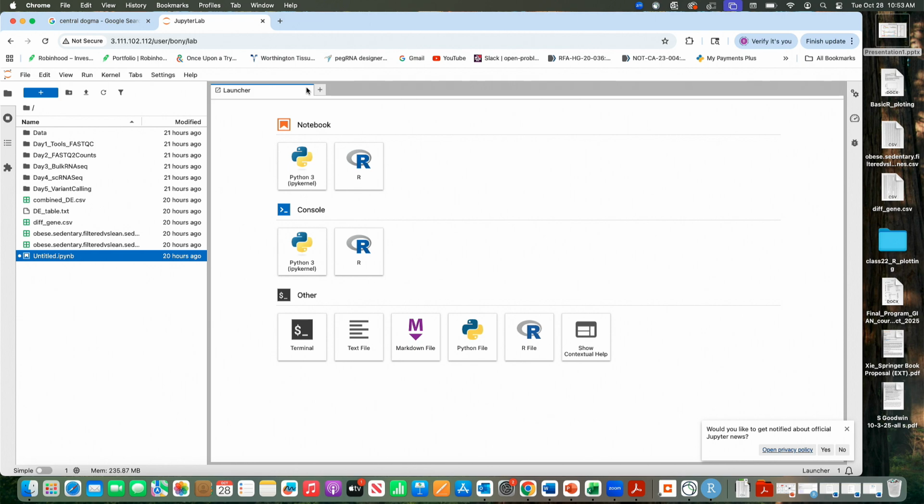It's not like you're just putting some random dots or lines together and saying this is what it looks like. A picture is worth 1,000 words. So we are going to see whether we can make a good picture even if we are not a Picasso or a Michelangelo, but can still be a good artist, and that is what we are going to do today. So let's start with our notebook.